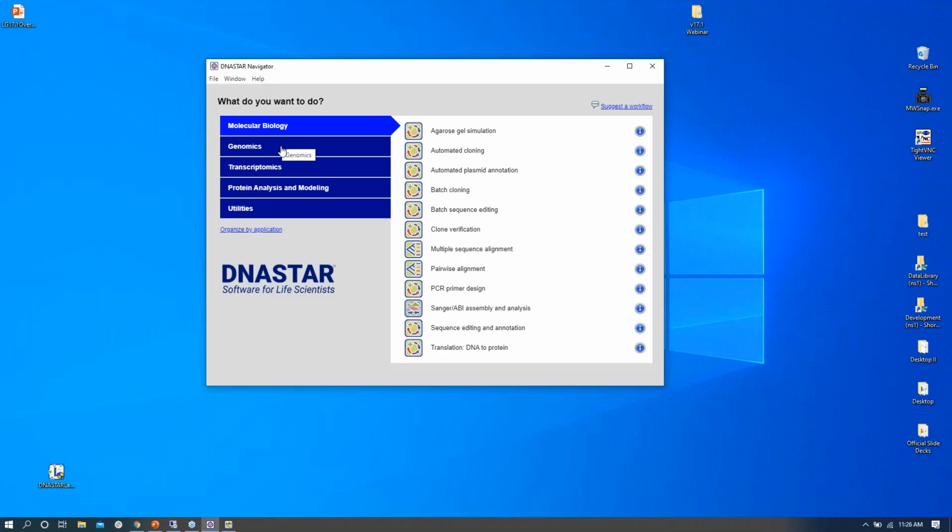Okay, gotcha. And then this last question, I'm not entirely sure I understand. This comes from Sarah. She would like to import a bunch of viral FASTA sequences to analyze SNPs across the genome relative to a reference sequence. And she says she could import them aligned or unaligned. Is it possible to do this in SeqMan Ultra or another package, i.e. without starting from the raw sequence data?